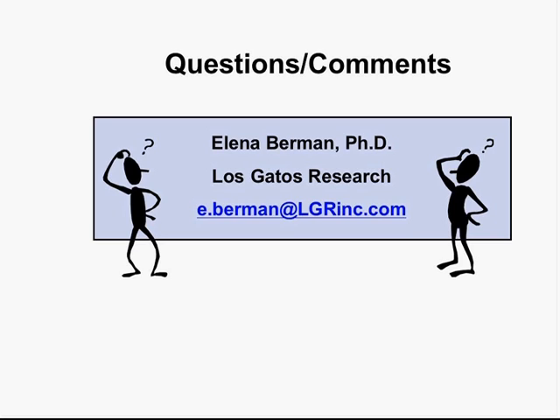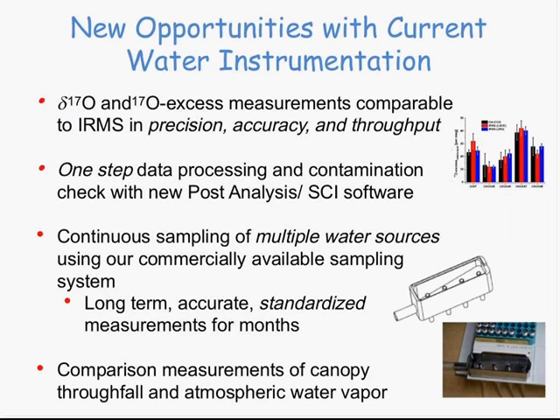This is regarding the spectral contamination you mentioned. You have shown methanol and ethanol contamination. So what will happen in case of natural organic matter, because they are high molecular compounds, and whether your software will also take care of those contaminants?